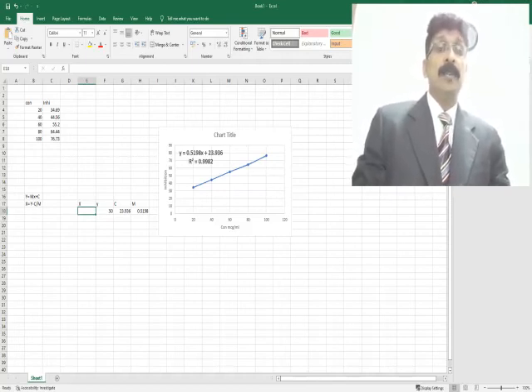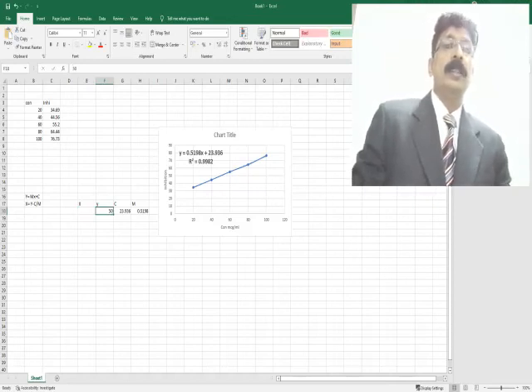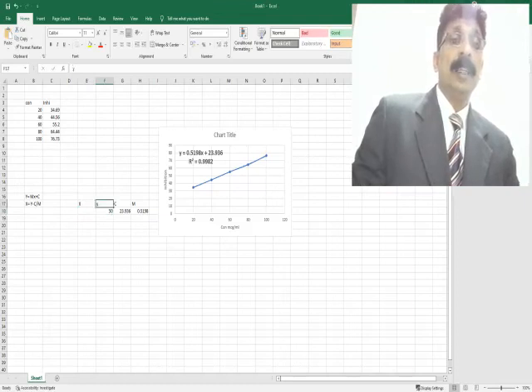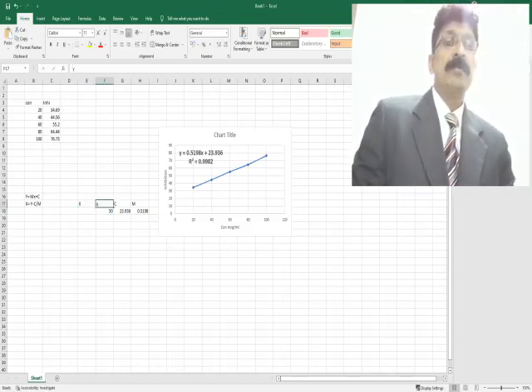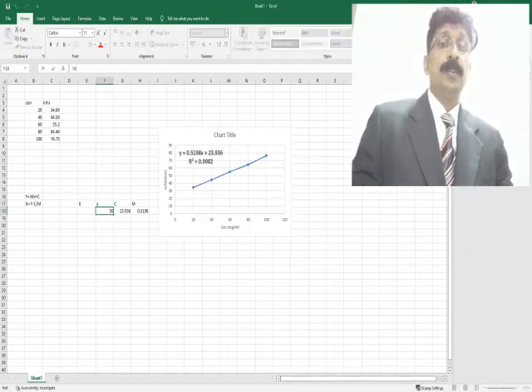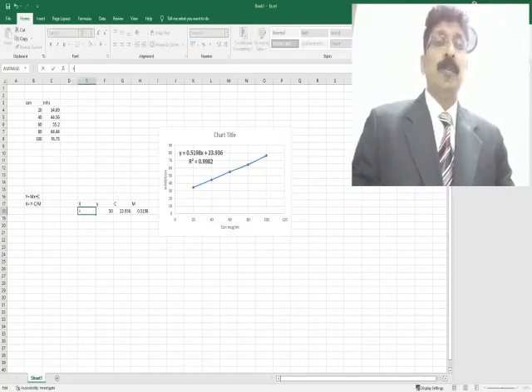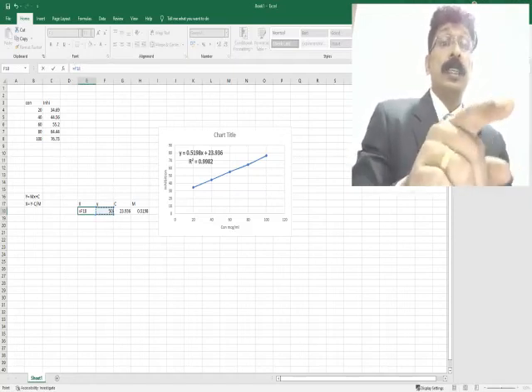Here it is written Y minus. So here you keep the cursor, go here and keep the cursor here. And what is that? Y. You have selected Y. Here only you have selected Y. This one, okay, Y. You should keep the cursor in the X value and you have to keep it equal to. Sorry, and not equal to. And then you are going for this one, Y. And it shows F18, okay.